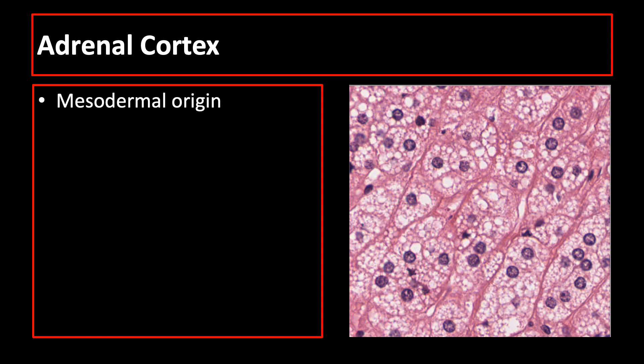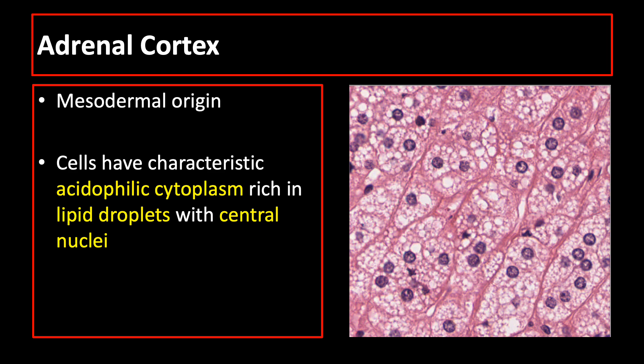The adrenal cortex is derived from mesoderm, and the cells of the adrenal cortex have characteristic acidophilic cytoplasm, centrally located nuclei, and cytoplasm that is rich in lipid droplets. Lipids are not stained by hematoxylin and eosin, so these lipid droplets are seen as unstained areas.